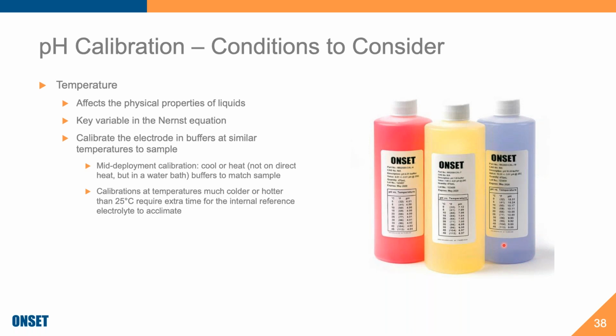So one good best practice tip that I can give you is that even if you're doing lots of calibrations using pH 10, I would recommend keeping the bottles small, 500 mils, maybe even a liter if you have to. That way you're not having buffer sitting open for too long and then getting contaminated just by the air. pH 10 will change its apparent pH just with the CO2 that's present in the air over time. So keep that in mind when you're storing your pH buffers.